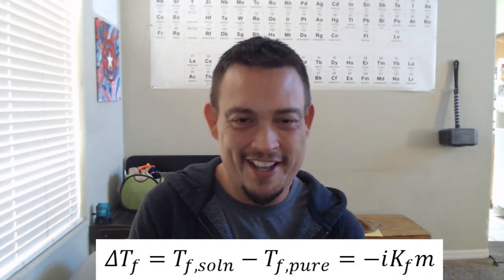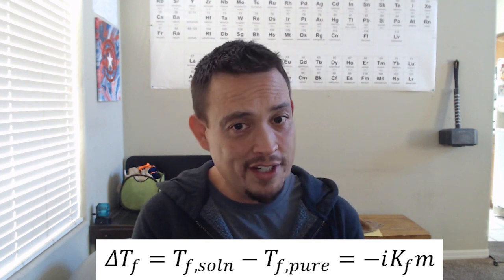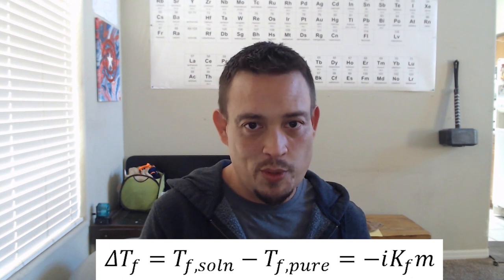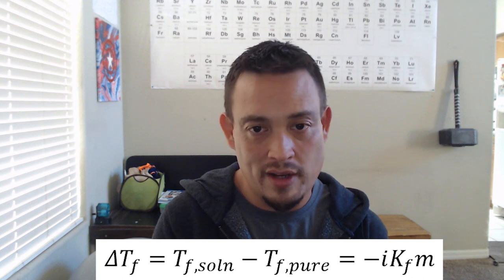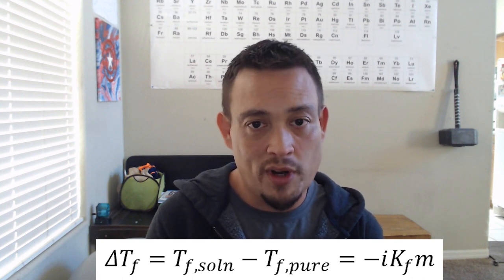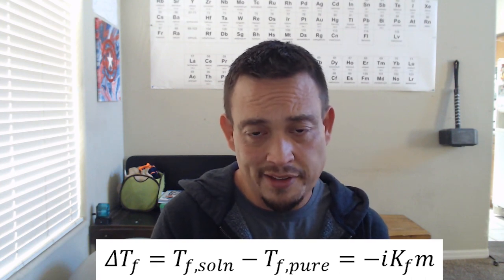And we're going to explore that numerically in today's experiment. During this discussion, you guys should have seen a lot of equations in your lecture, but I want to focus on the one that is important for today's lab. That is the freezing point depression equation. So this equation is defined. I'll put it right here down below. So it is delta TF. The change in the freezing point is equal to final minus initial. That's typically how we measure change. And it works out where we say it's the freezing point of the solution minus the freezing point of the solvent. And that works out to be negative i KF times M.